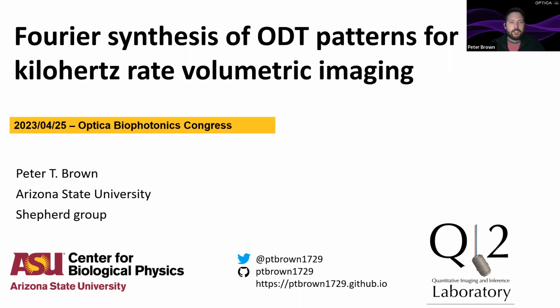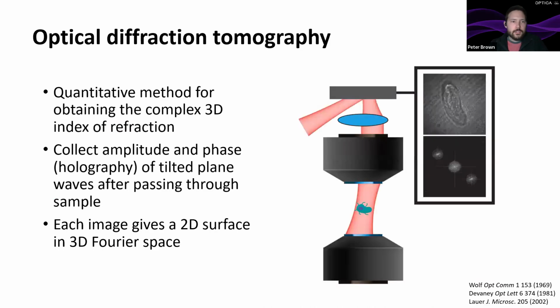Good morning. I'm excited to share our recent work where we developed a technique called Fourier synthesis to expand the speed and multiplexing capability of optical diffraction tomography pattern generation, with the aim of realizing kilohertz rate volumetric imaging for a variety of applications, but particularly for studying the swimming of single-cellular organisms.